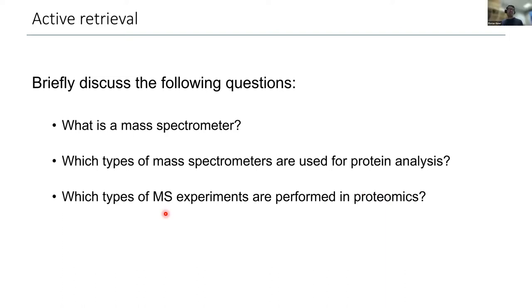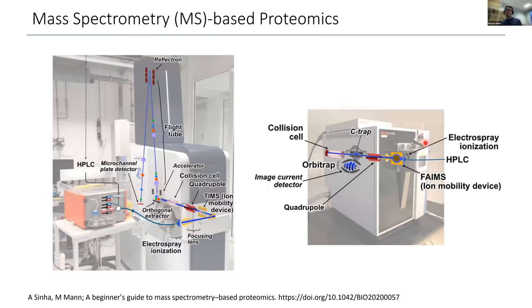So this is really, I think, what we will need. And in the rest of the seminar, we will go through these different points and see how they are used and useful in proteomics. So as we just discussed, we typically use QTOF instruments. And on the left, you see the instrument type that is used in our lab. So this is the timsTOF. And in proteomics, it's typically coupled to an HPLC, or more specifically a nanoflow HPLC.